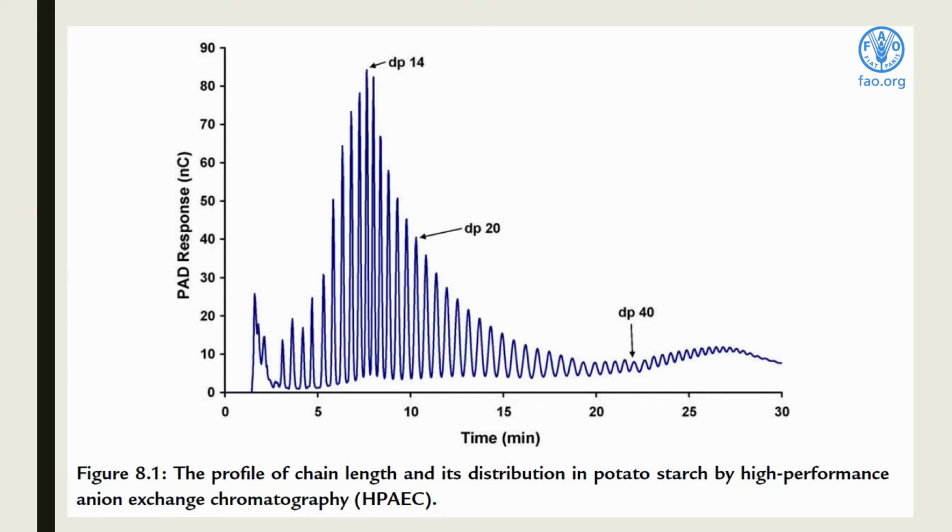So here is an example of the result of high-performance anion exchange chromatography. Last time I explained about this one.